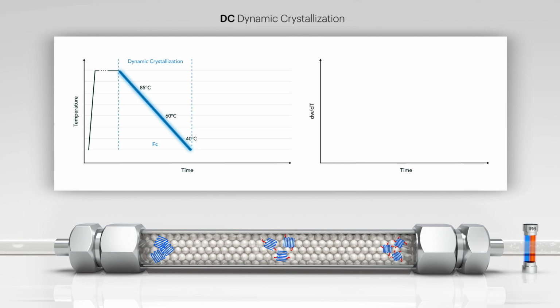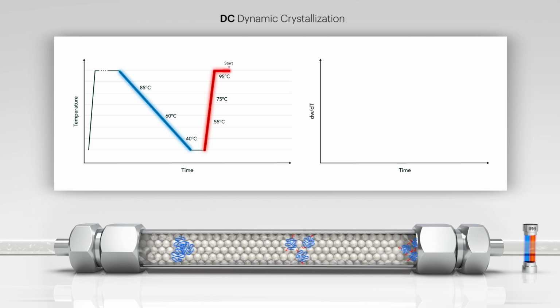end of the column. Once the crystallization cycle is completed, the flow stops and temperature is increased to dissolve in situ all components still deposited inside the column. After a few minutes at high temperature, the flow resumes to elute the components from their positions within the column. The elution volumes are related to the crystallization temperatures and thus to the number of branches per 1,000 carbons.